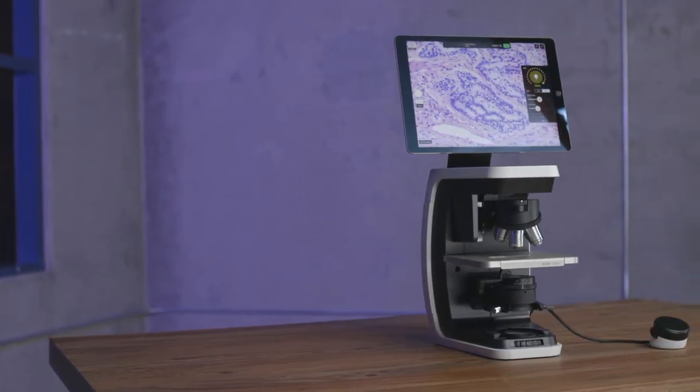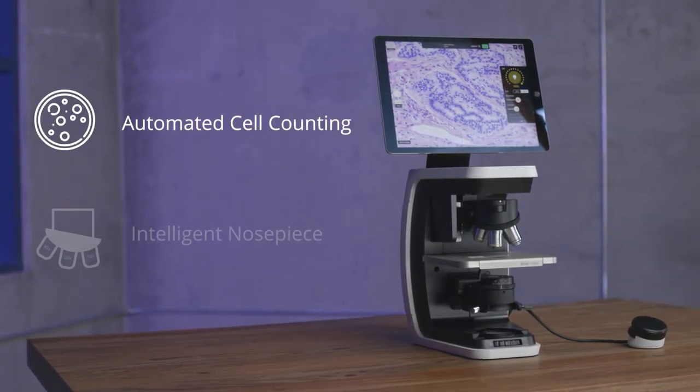Lastly, we're excited to announce we will be bringing automated cell counting and an intelligent nosepiece to REBEL in the near future.